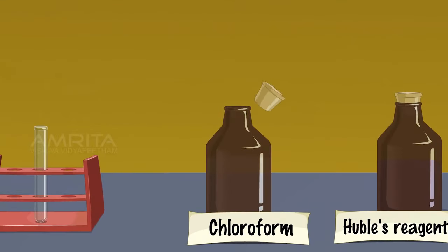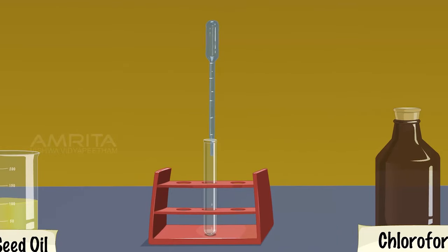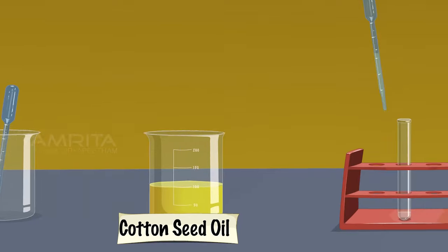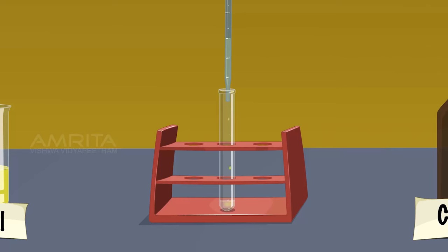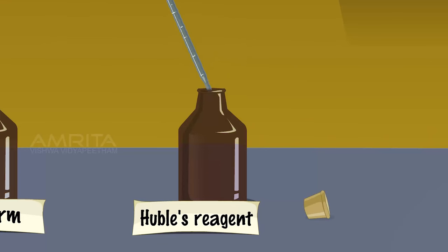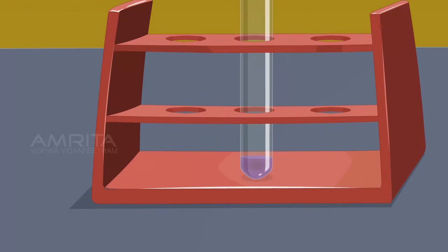Hübl's Test — Cotton Seed Oil. Using a dropper, take about 3 ml of chloroform in a test tube. Using another dropper, take a small quantity of cotton seed oil and add about 4 drops into the test tube. Shake the test tube well. Add about 3 drops of Hübl's reagent into the test tube containing the mixture of chloroform and cotton seed oil. The violet colour of iodine in the Hübl's reagent does not fade away, indicating that cotton seed oil is less unsaturated.